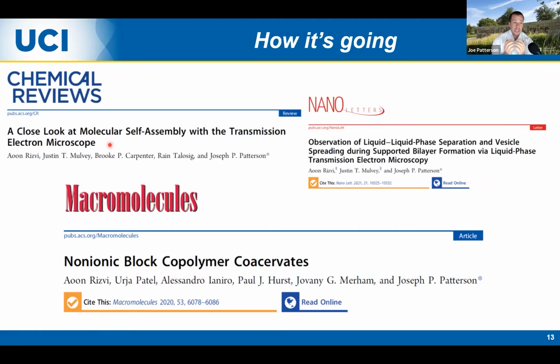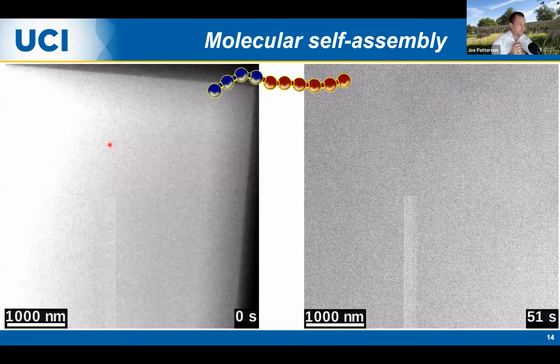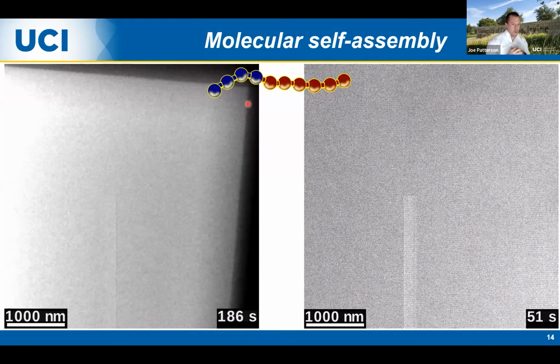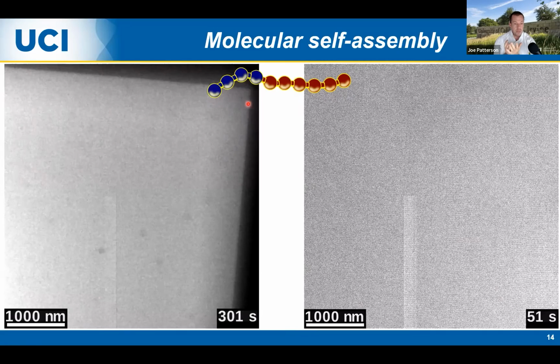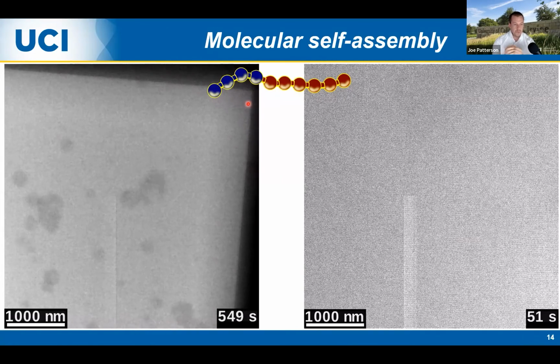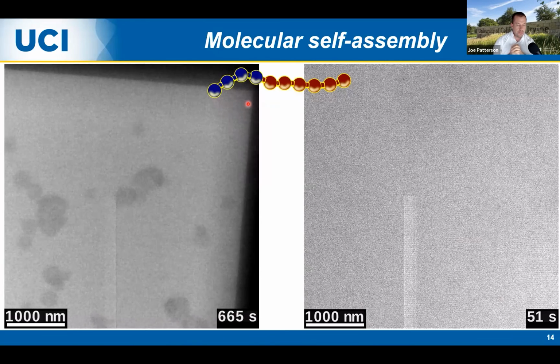And we think looking at how things work, taking pictures of things, is one of the best ways of generating hypotheses because often things don't look the way you expect them to. So here we're going to look at a couple of movies of these molecular self-assembly events. There are polymers, amphiphilic block copolymers, in this solution, and they're going to start forming these nanostructures. And so what we'll see is these really sort of appearing out of the background from the very smallest size, and then they start moving around and fusing together to make these solid materials.